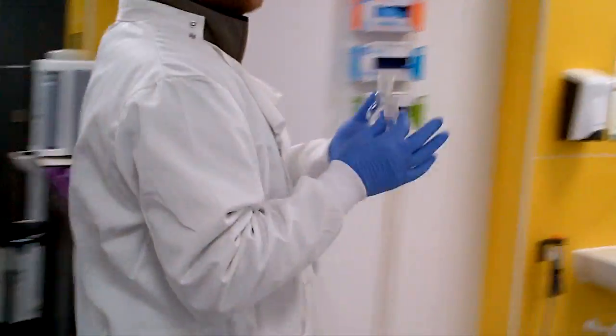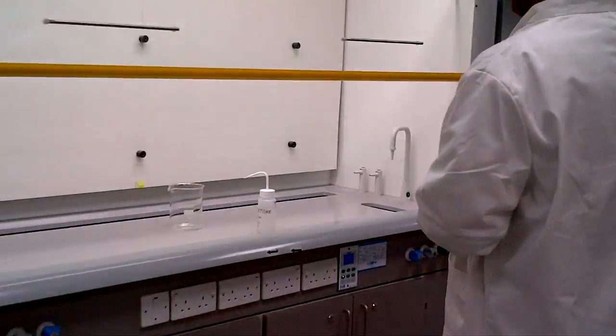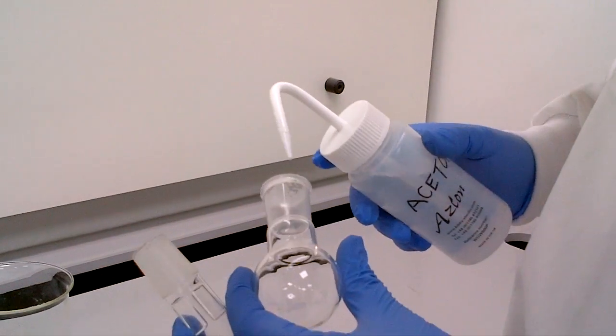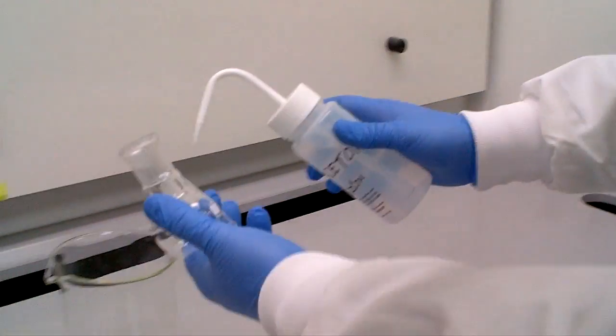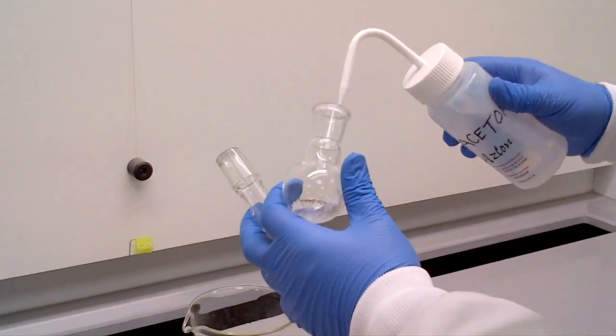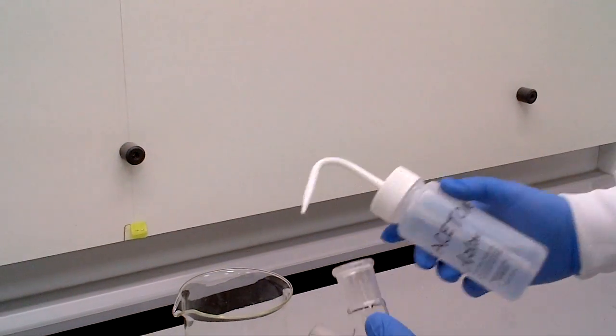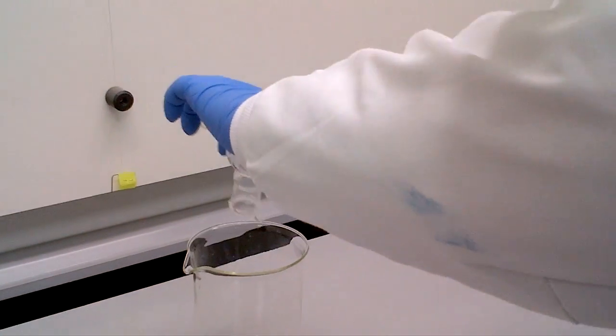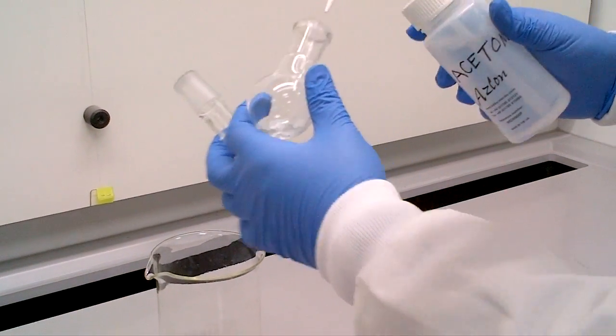And then you'll need to enter one of the fume covered areas in the lab, and you'll need to take acetone. This is why I've got my gloves on. You're going to take some acetone and rinse round. So just take the stopper and rinse the top of the stopper. Rinse round the inside of the flask. Swirl out into the waste beaker. The flask. Swirl out.